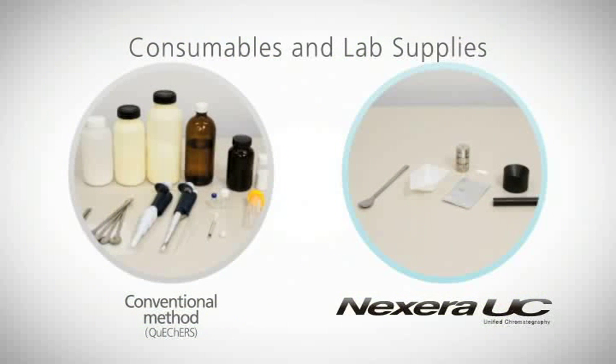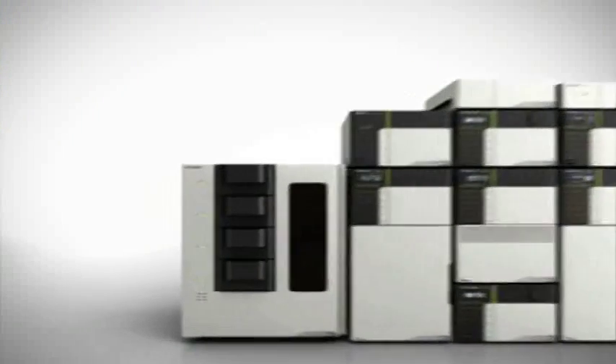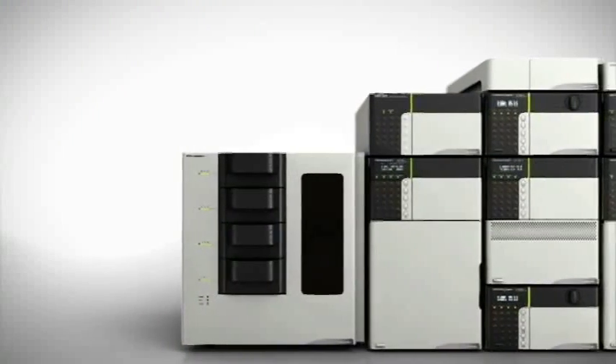When compared with conventional methods, the use of consumables, cleaning of supplies, and the chance for error are minimized. For complex multi-compound analysis, Nexera UC provides fast, reliable results.